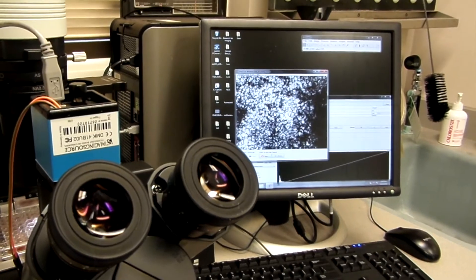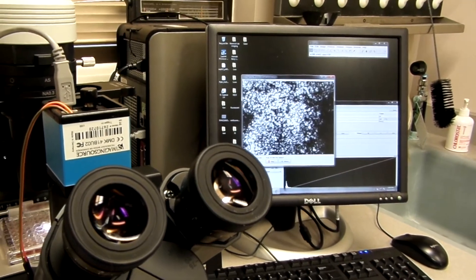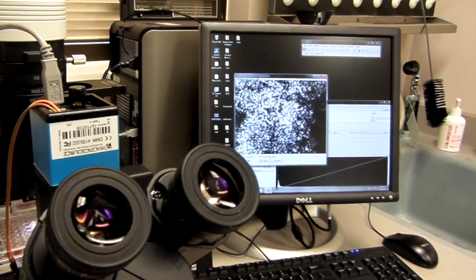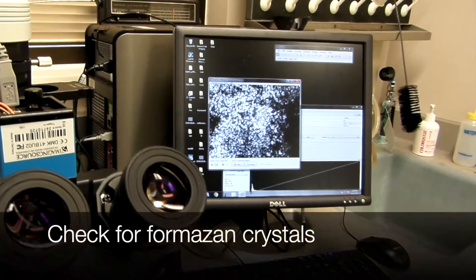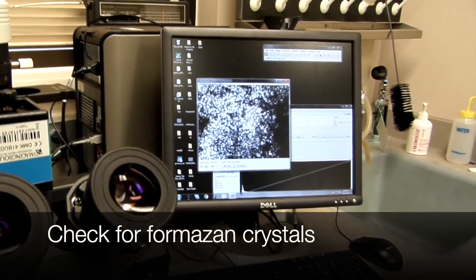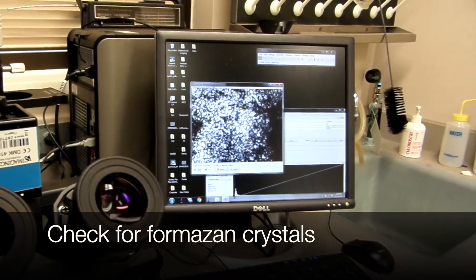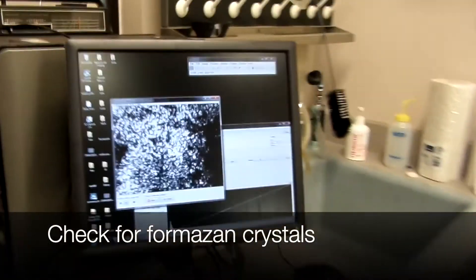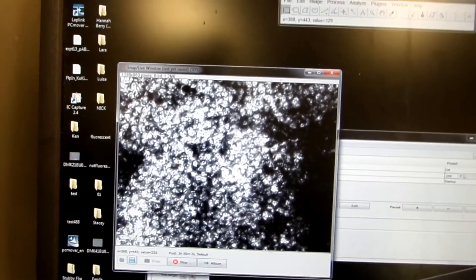After 4 hours of incubation, what we need to check for is the formation of the formazan crystals. You can see these dark spots — these are the formazan crystals, and they are insoluble.